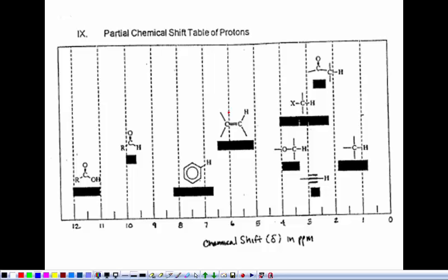So basically we look at where the hydrogen is, and where that shows up on this chart is going to tell us what kind of molecule we have. Well, it's correlation. Everything's been done by correlation. After you have the peak positions of 2 million compounds, you can begin to predict, simply by correlation, where hydrogens attached to a certain group will show up.